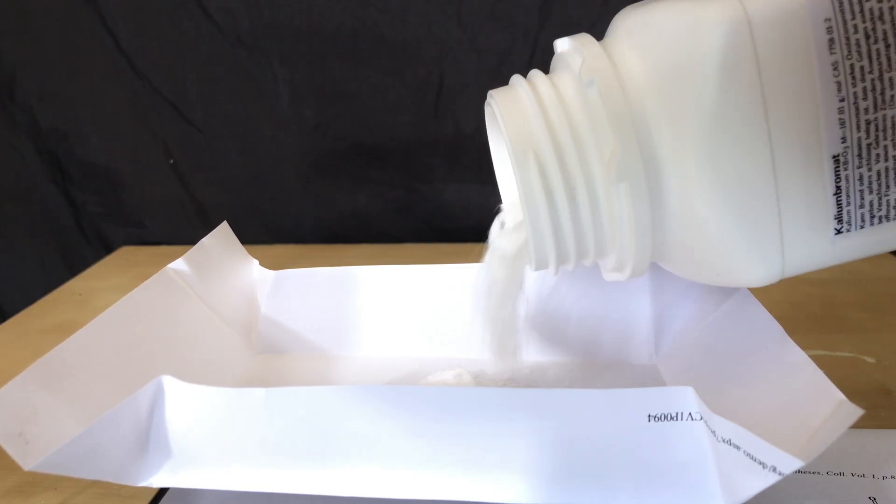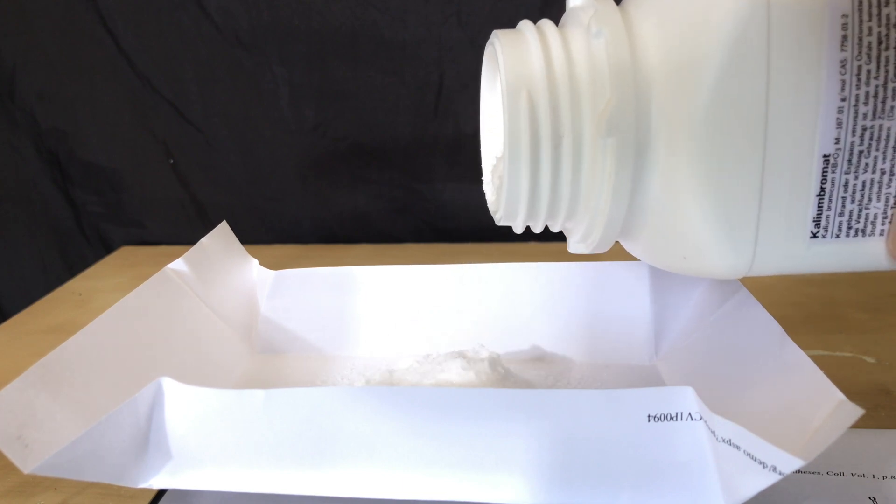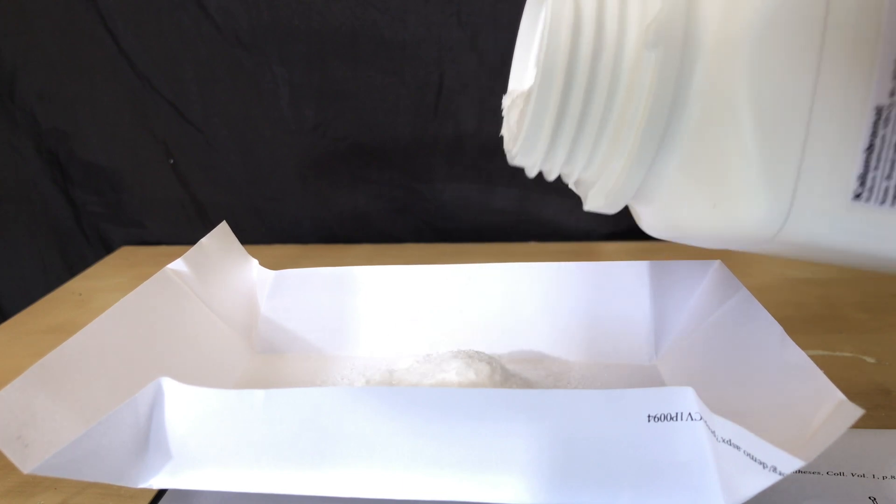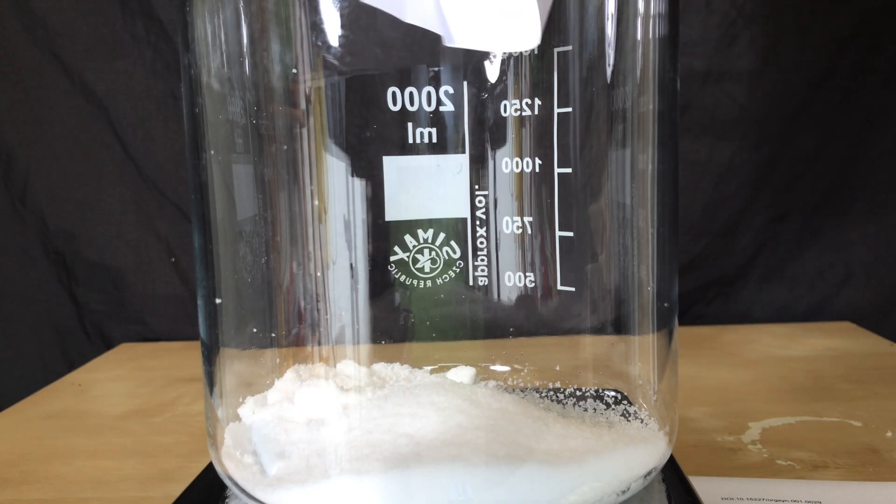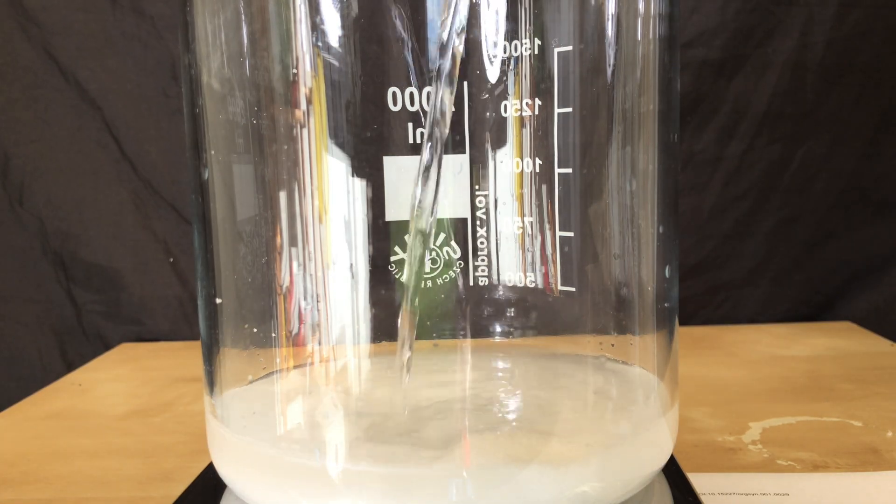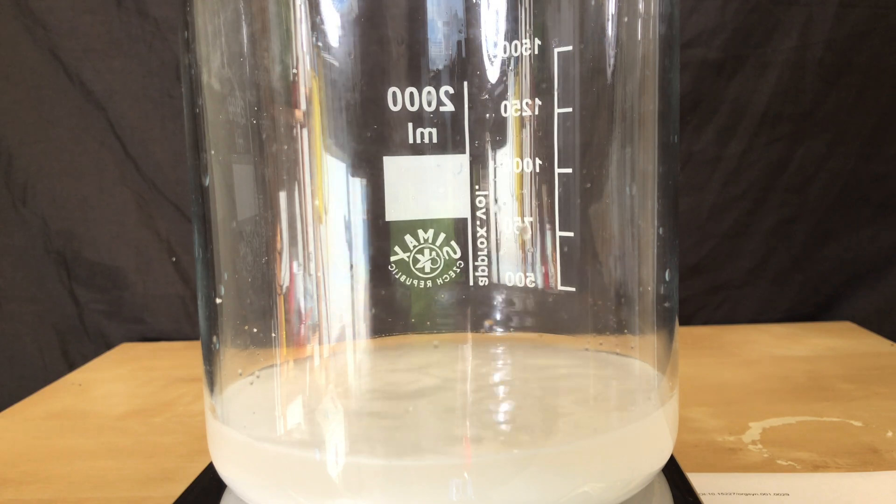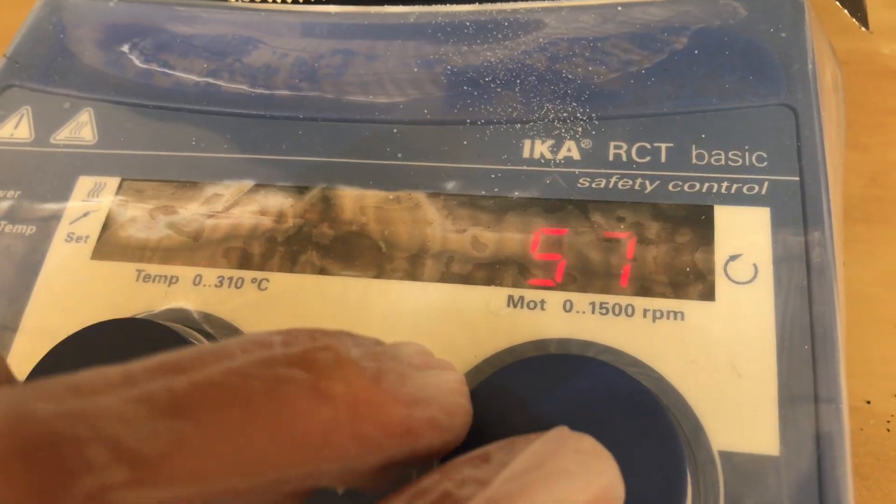The second reagent I weighed out was potassium bromate. I even made this potassium bromate myself in a previous video. Keep in mind that potassium bromate is carcinogenic and you should wear gloves while handling it. We then added approximately 193.2 grams of distilled water to this mixture. The beaker was quickly put on the hot plate and heating and stirring were turned on.